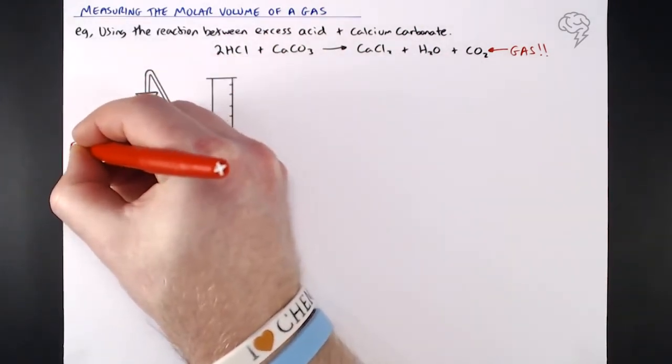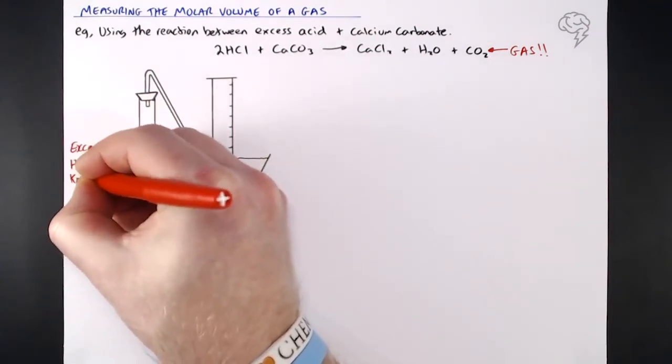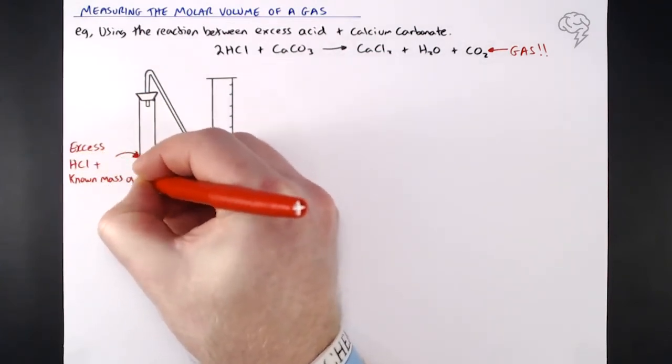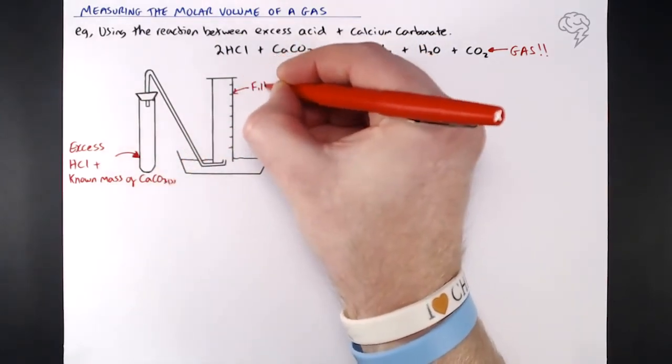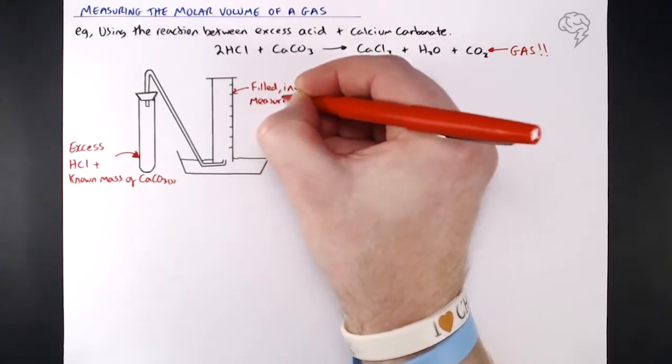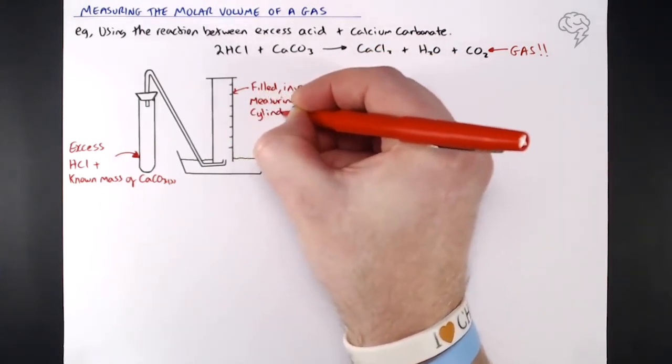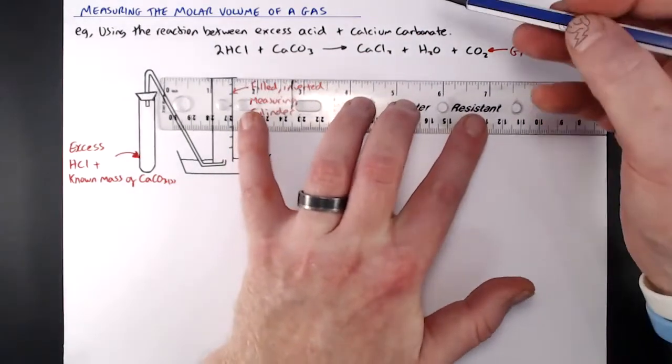This is what we've got: excess hydrochloric acid and a known mass of calcium carbonate in our boiling tube. That's sealed airtight with a bung, and then of course that gas will be delivered into this filled with water inverted measuring cylinder. The gas comes through there, bubbles through, displaces the water, and we can measure the volume of gas given off from the entirety of the reaction.